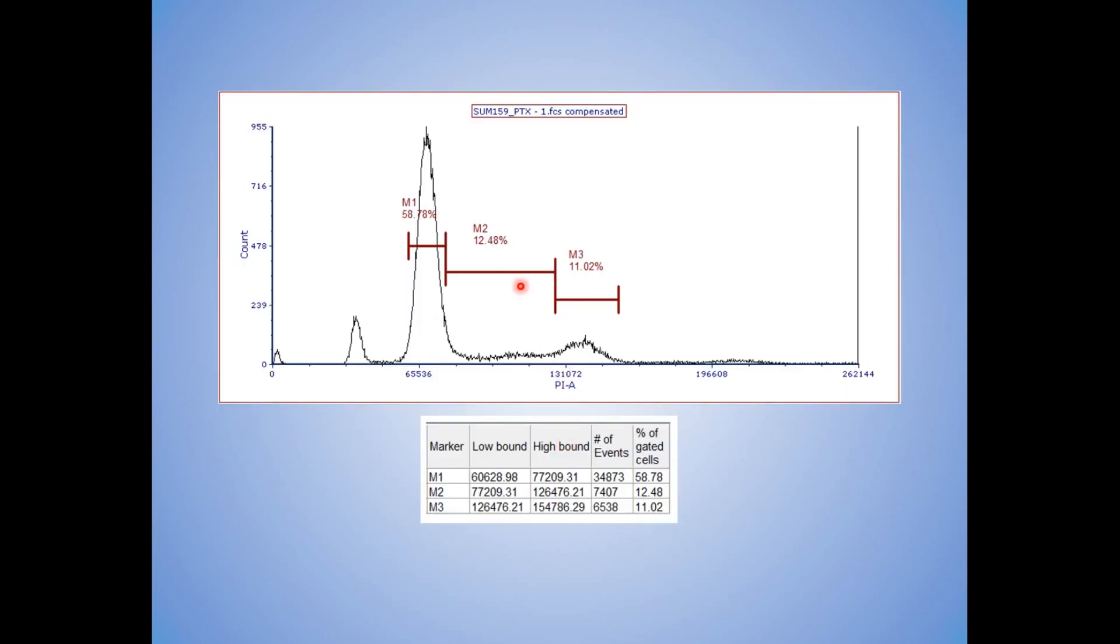Here's a sample file that I have from the core and I'm basically doing region analysis. I've got M1 for G1, G2, G1, G0, M2 for S, M3 for G2M.